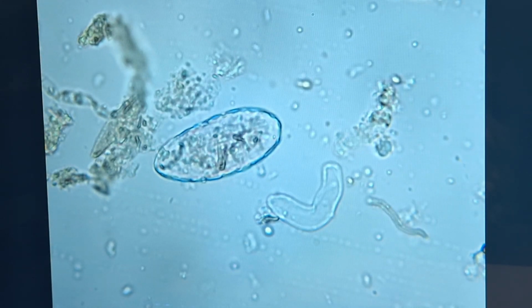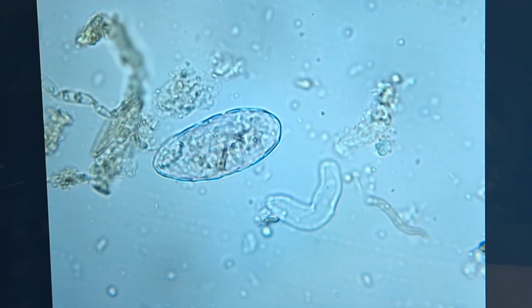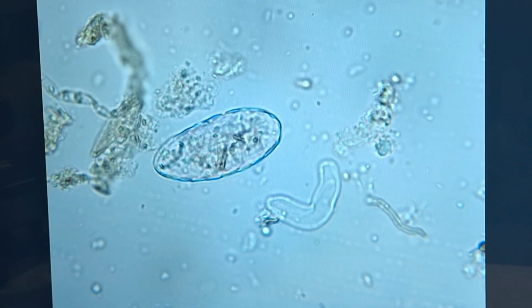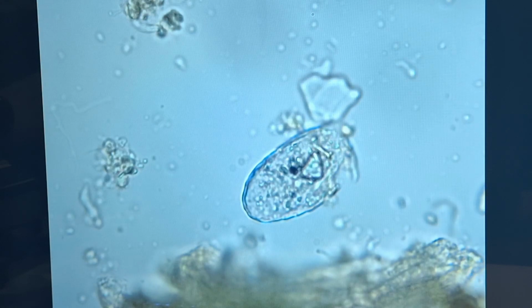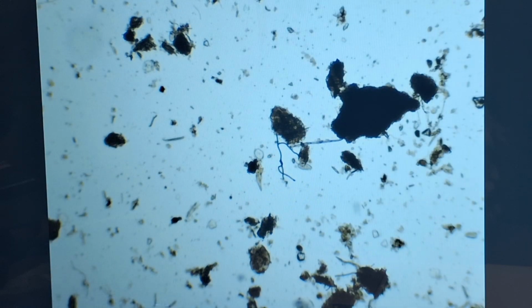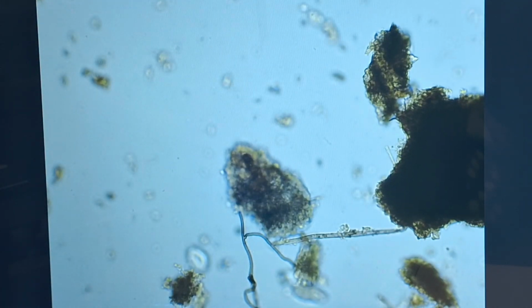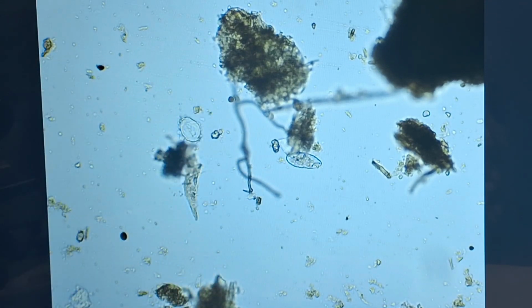Not as well as I thought you could. So the mouth's right there. You see the insides again, the shell around that. So it's a testate amoeba. A shelled amoeba. Another shelled amoeba. Doesn't look in the greatest of shape. As we scroll around looking, when I see something like that, you'll believe that that's going to be a testate amoeba. Looks like. I'll zoom in one layer and see. And we were right. It's a testate amoeba next to a nice piece of fungal hyphae.